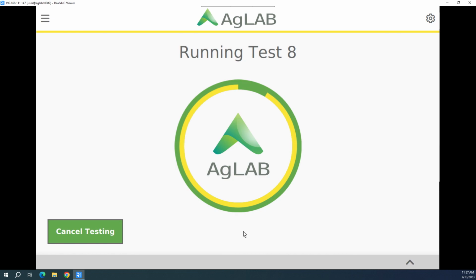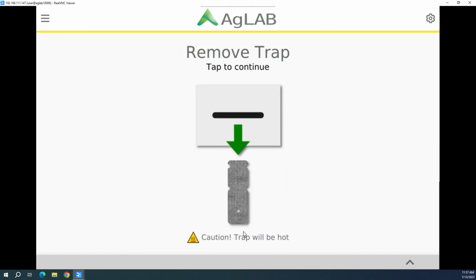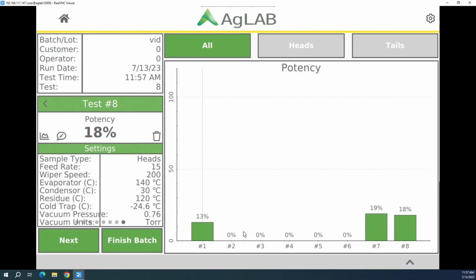But I guess it kind of comes with maybe the quantity, like you were saying, of terpenes. If you need more terpenes, you don't want to necessarily do it through your evaporation temperature because that's going to hurt the chances of CBD making it through to the other stage. Instead, you just want to increase the overall time so that they all get a chance to get exposed to it.